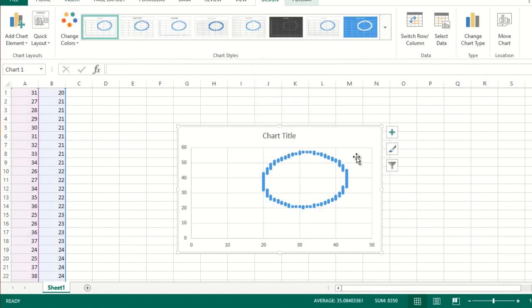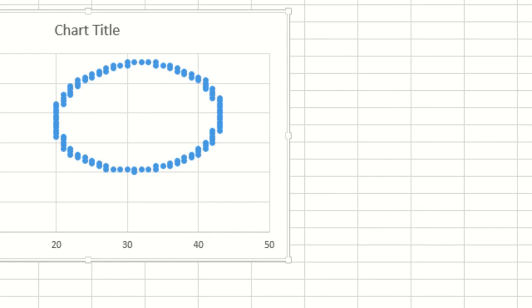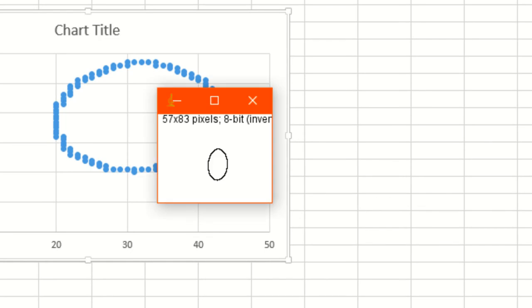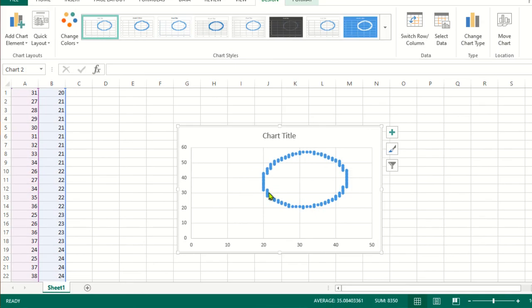You can see this is your desired drop shape, which is the same as this.